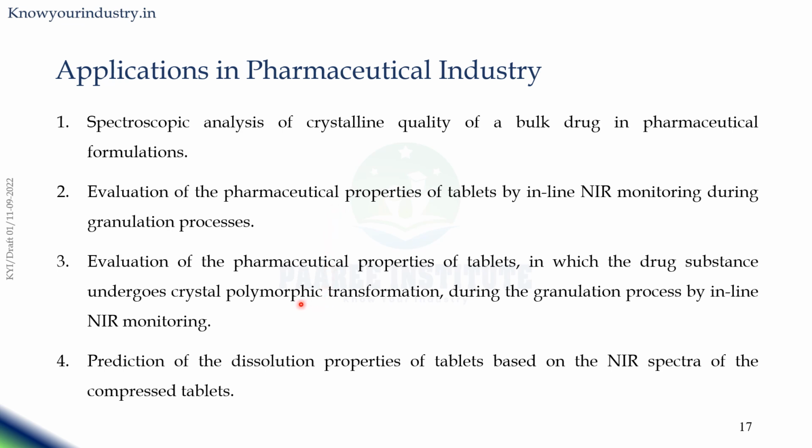It is also used to evaluate the pharmaceutical properties of tablets in which the drug substance undergoes crystal polymorphic transformation during the granulation process, by inline NIR monitoring. It is similar to the previous point, but here we are specifically seeing the change in the polymorphic nature of the drug substance during granulation.